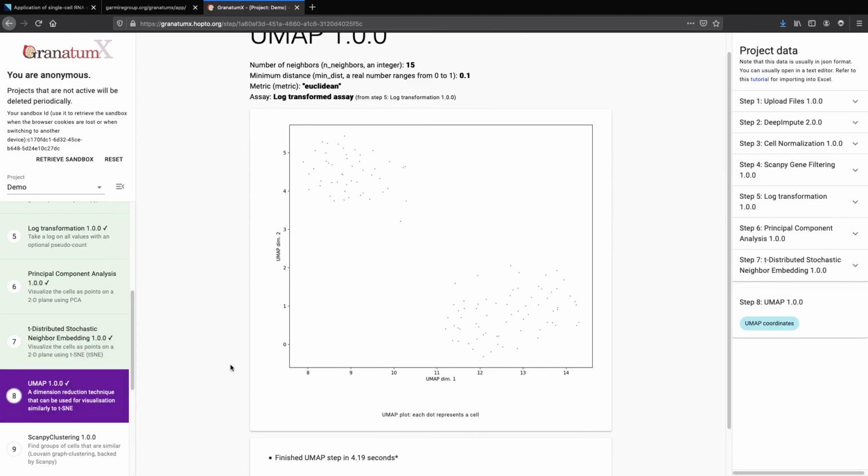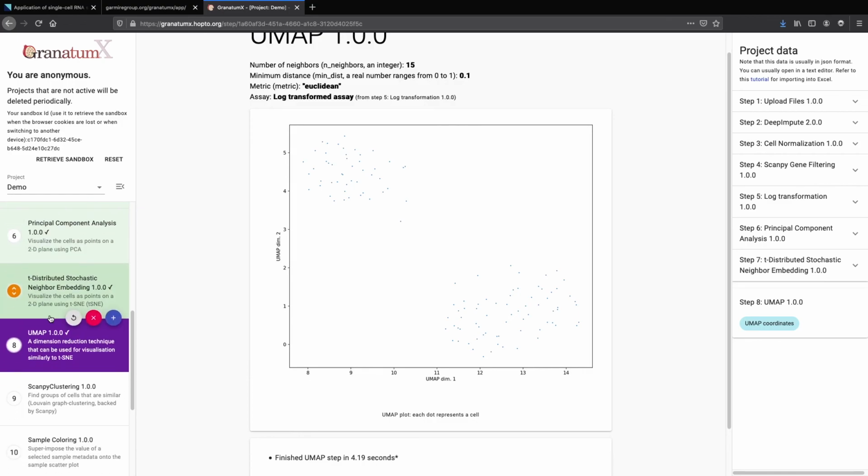It is actually more common in the field to use the UMAP coordinates, so we're going to explore this plot in detail. In this UMAP plot, we can roughly detect two clusters that are relatively separable. In order to detect the true underlying subpopulations within these assays, we need to perform unsupervised clustering to group cells that are biologically similar.